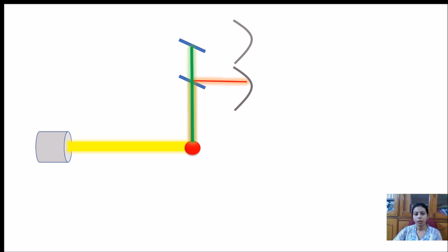We will have two detectors. Actually, in fact, 18 different colors, or 18 different markers, can be detected at a time. Here we have used two, so I have shown only two colors of deflection. Because of the sidewise deflection, one detector will be detecting the red fluorescent color, and the other will be detecting the green fluorescent color. And this is the monochromator which is lying over here, which allows the passage of a certain wavelength of light, and this will deflect it toward the detector.